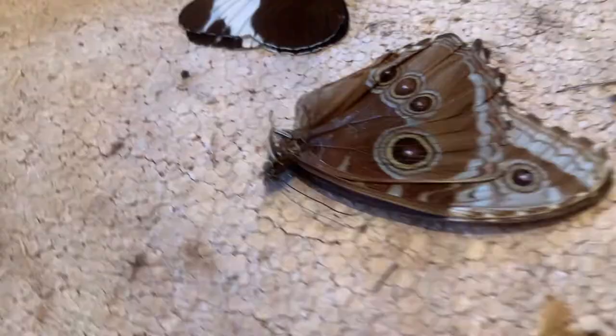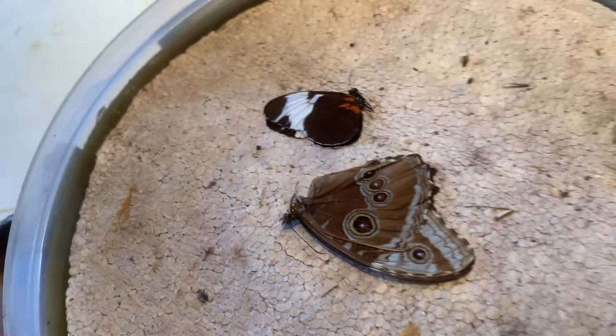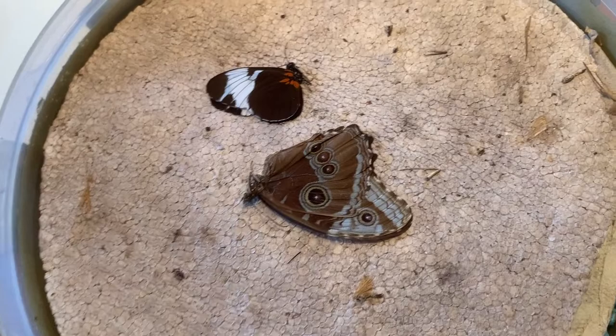Finally, if you don't get to all your specimens in one sitting, you can leave them in there another day, but I would not leave them in any longer than 48 hours, because they will start to decompose. And that's about it.